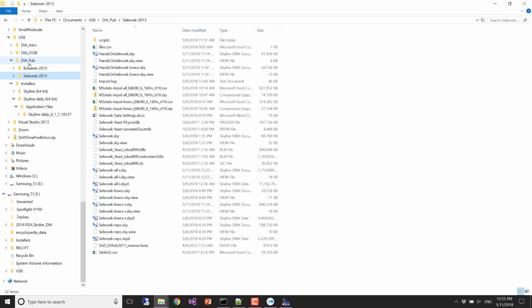So it's like real life, this data, you don't want to be doing it on your laptop. In real life, you should get a desktop computer. I would recommend getting one with 64 gigabytes of RAM. As I said, for $2,000 you can get a hex core with 64 gigabytes of RAM now, and I would do that. You're going to be way happier processing data like this under those circumstances.